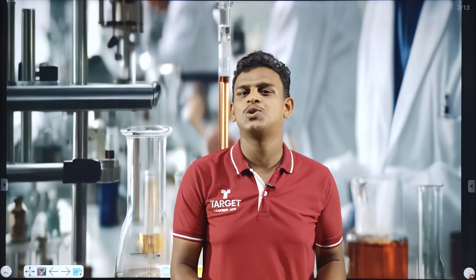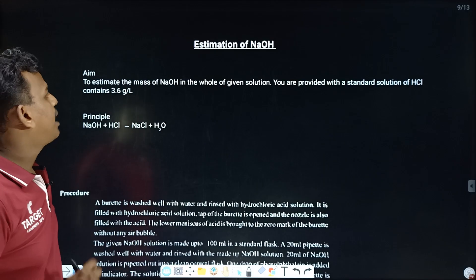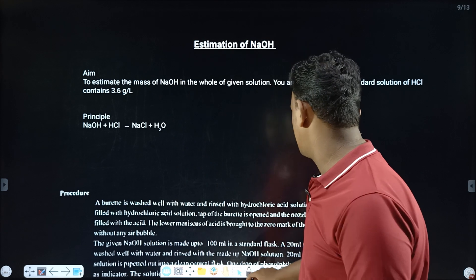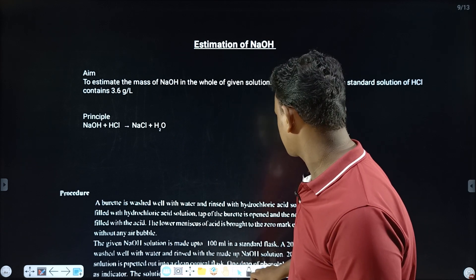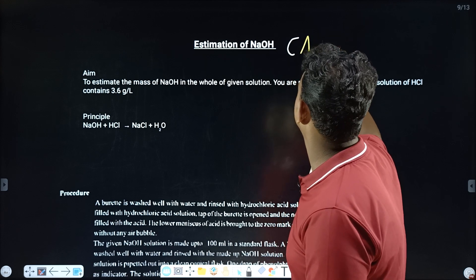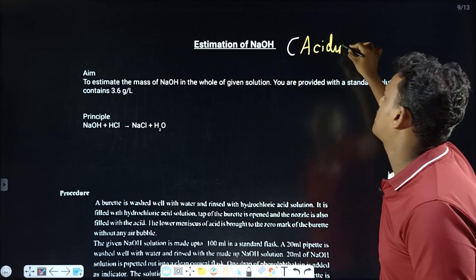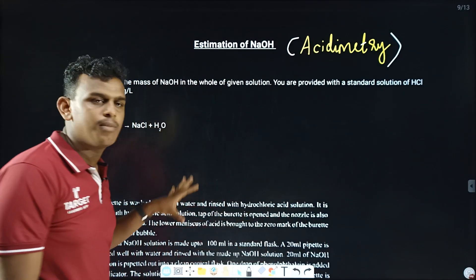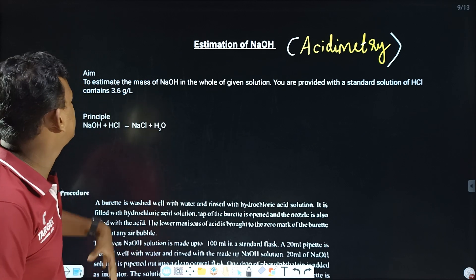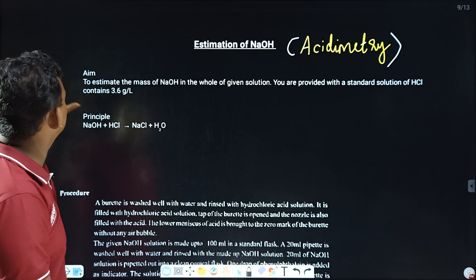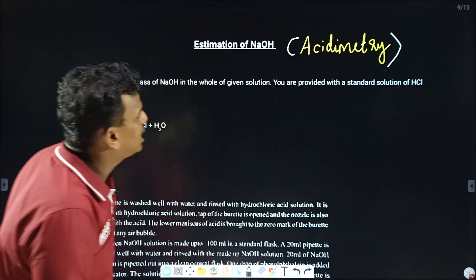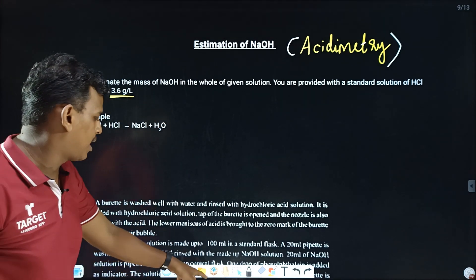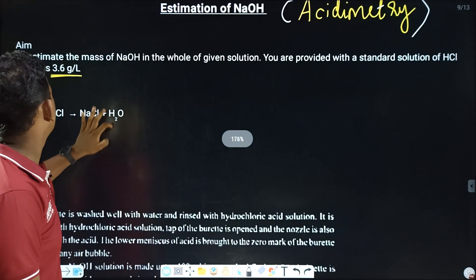Hello guys, welcome back to Plus 2 Chemistry Practical Series. This is an acidimetry experiment. We are using a standard solution of HCl. You are provided with a standard solution of HCl containing 3.6 grams per liter. That is our aim.